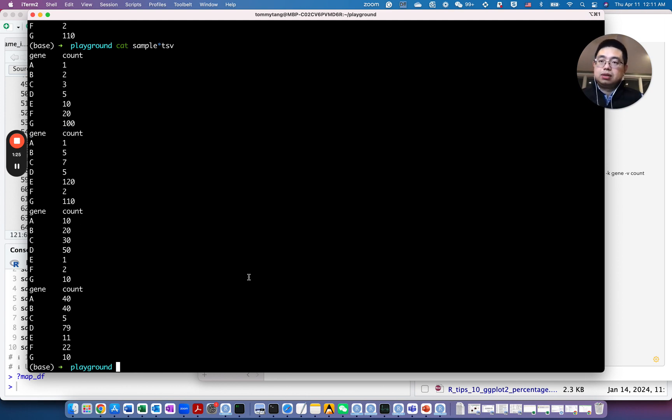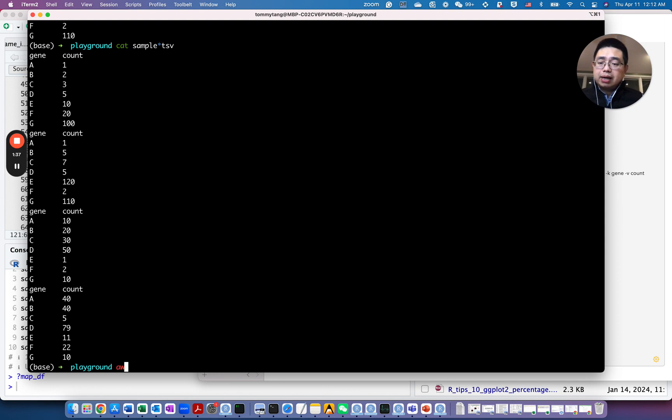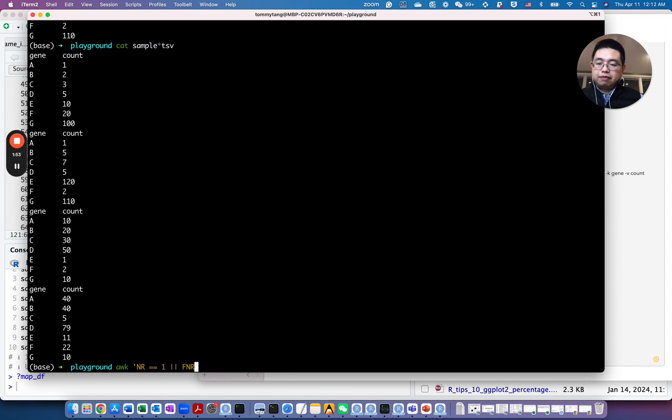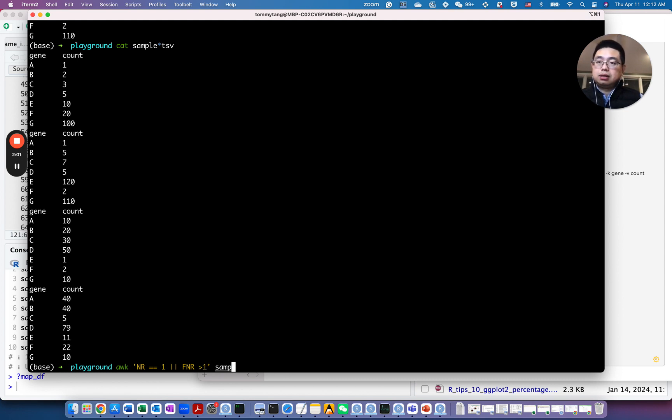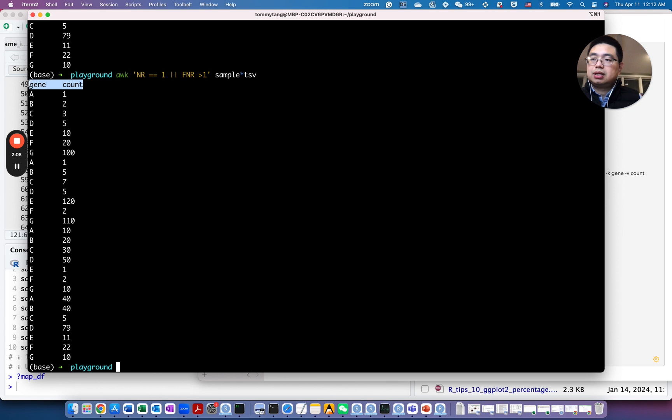So what you can do is instead of using cat commands, you use the awk command. So awk is a very powerful tool for data wrangling. I highly recommend you to learn how to use it. So in this case, we can use awk with this NR equals to one or FNR greater than one. Then sample.tsv, and let's see how it looks like. Now only the first header is getting printed.